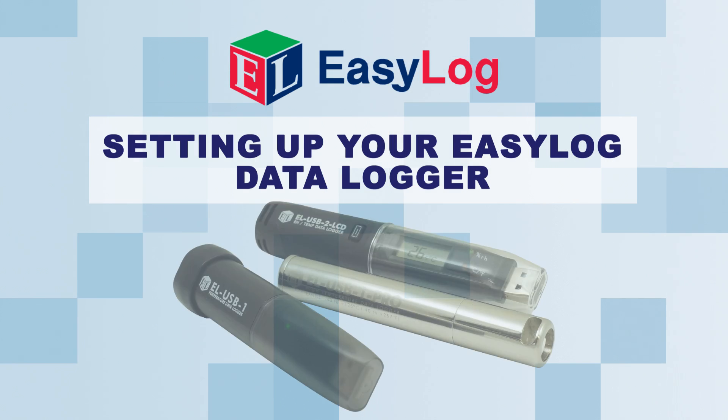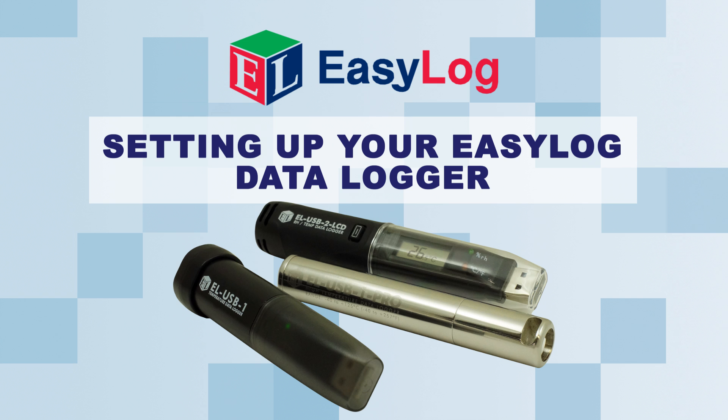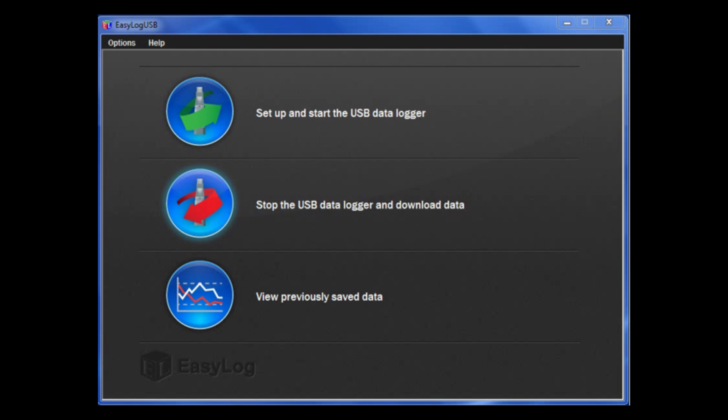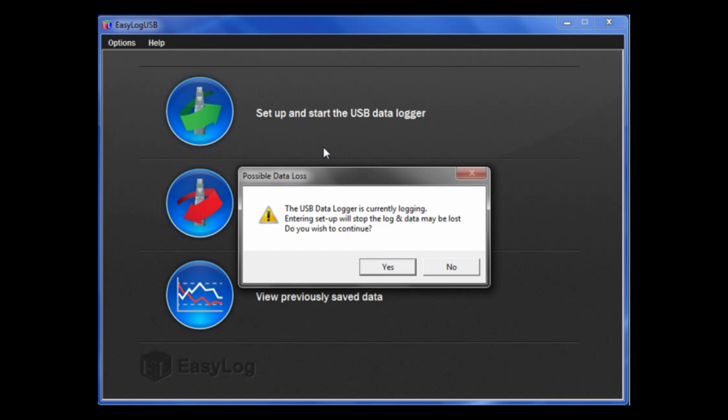In this video, I will show you how to set up your USB data logger. To begin, click Set up and start the USB data logger.